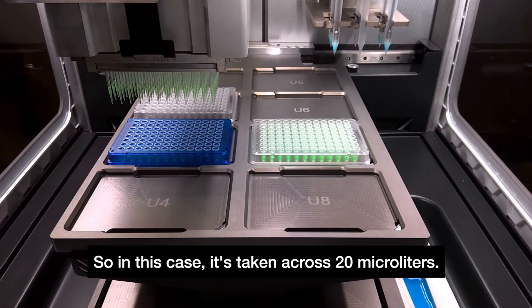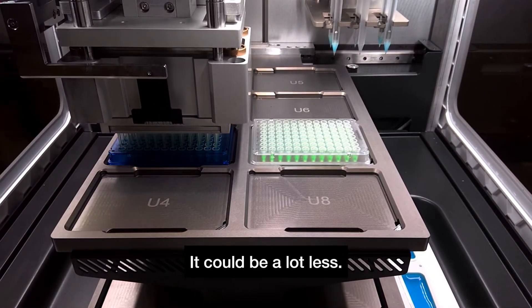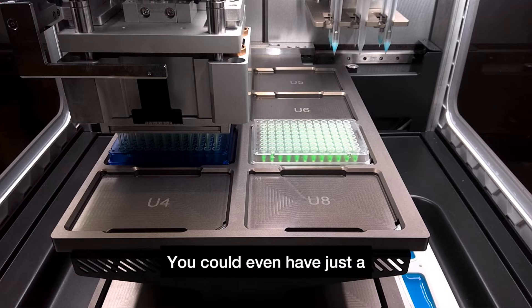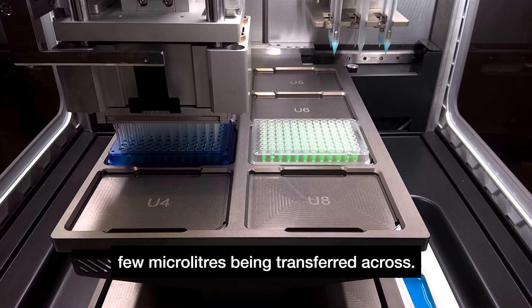In this case it's taken across 20 microliters, it could be a lot less, you could even have just a few microliters being transferred across.